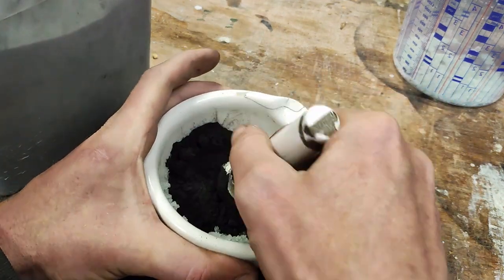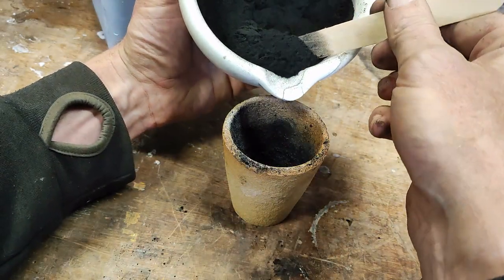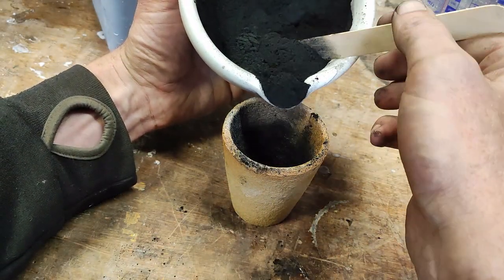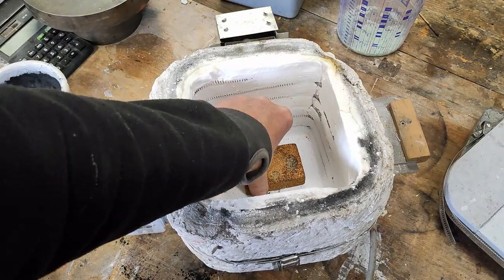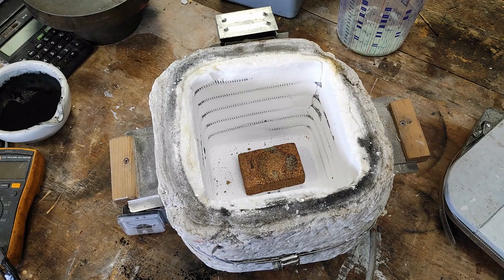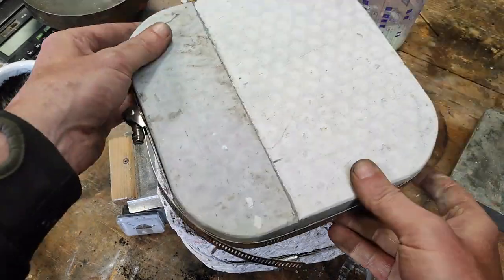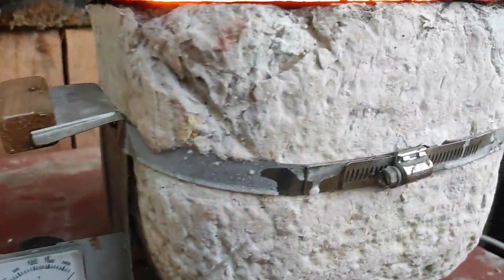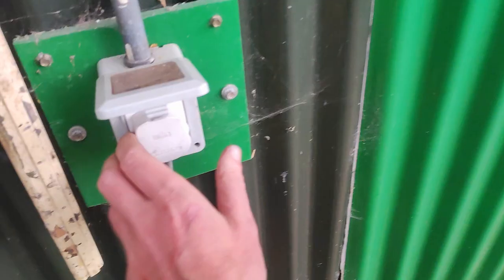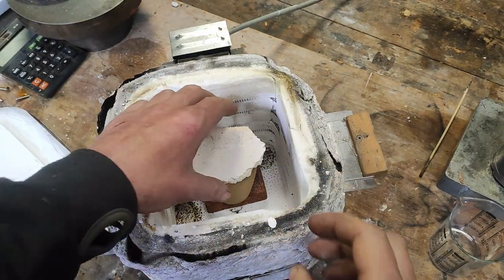So what we're doing here, I believe, is a reduction, and we are going to heat the mixture in a clay crucible in a little kiln. The idea here is to exclude oxygen from this reaction. So the oxygen from the sulphate combines with the carbon to make carbon dioxide and carbon monoxide, and it's carried away as a gas, leaving sulphide behind.